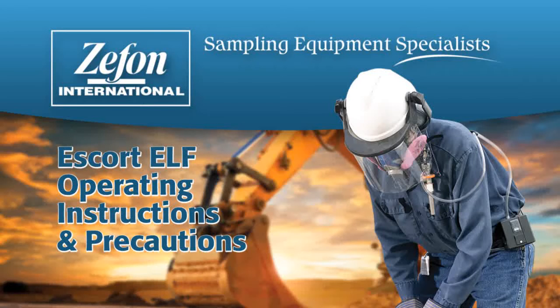This video is a basic guide to the operation of Zeffon's Escort Elf Personal Air Sampling Pump. Please consult the Owner's Manual for more detailed operating instructions and precautions.